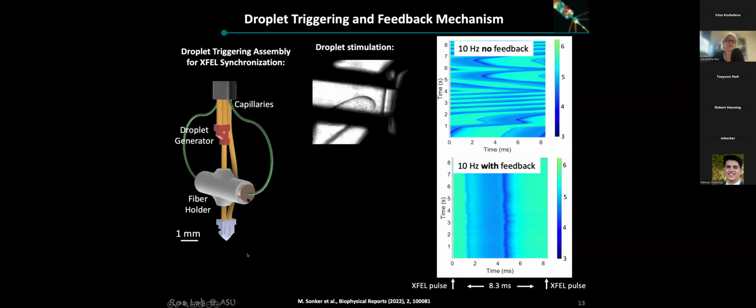So with this slide, I want to show you that the concept actually works. The video shows crystals that are injected in that way. What you can see in this video is this typical electrowetting effect when they're triggered. So this is all working out.